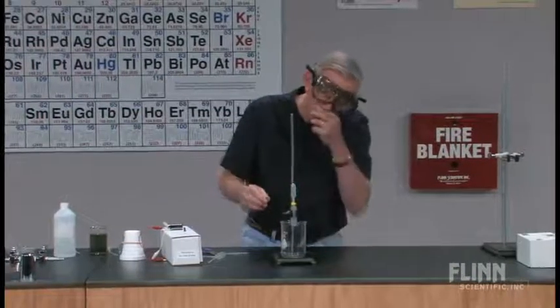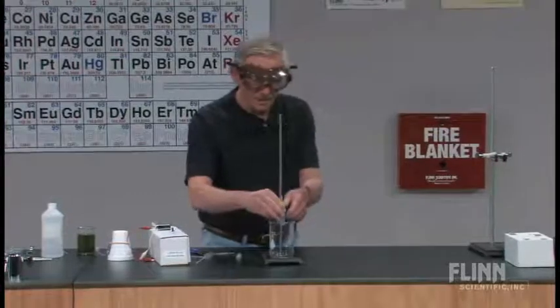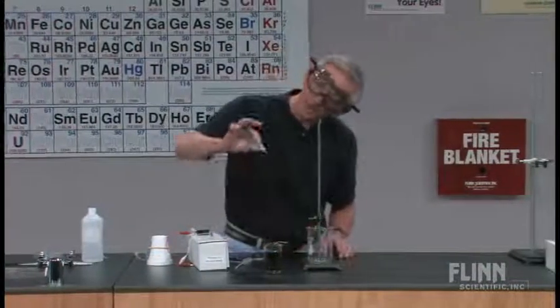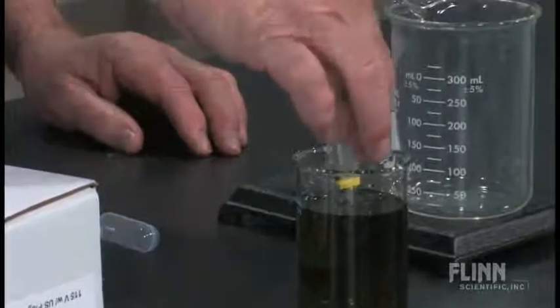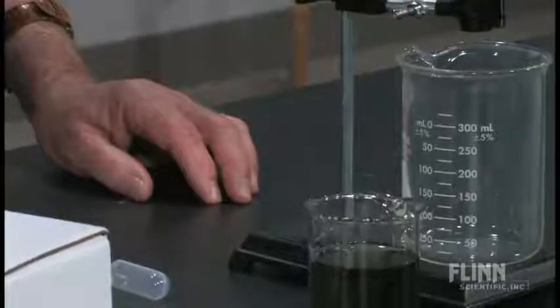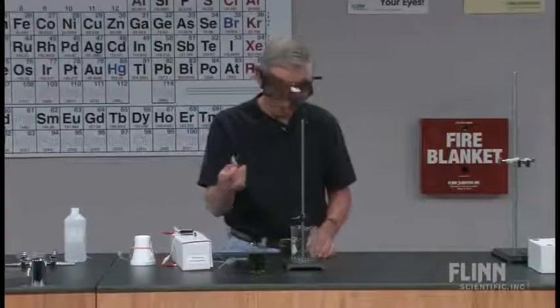If it's not, then what's going to happen is bubbles of gas are going to come out the bottom of the stem rather than where I want. So, I need to electrolyze sodium sulfate solution. So, the trick on this is to squeeze on the sides, not on the leads. Squeeze some air out. Do it again. Squeeze some air out. I want it about 3/4 full. Okay, that'll work.